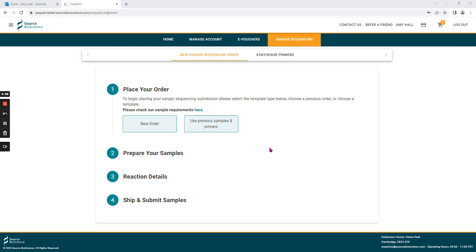When placing a new order, please log in to your account and it will bring you to this page. Here you can place a new order from scratch or you can choose to use samples or primers from a previous order within the last three weeks.